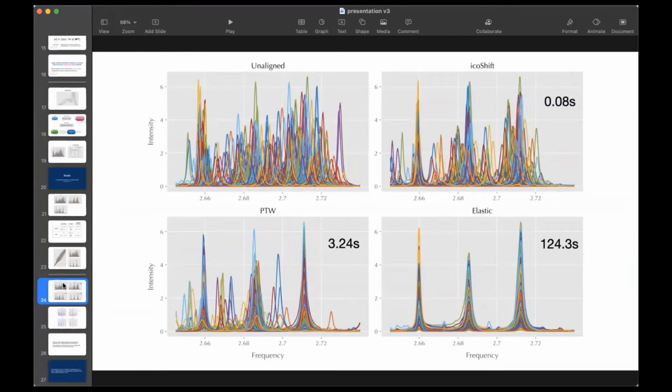As you increase the degrees of freedom on your warping functions, I'm sure you can capture the phase variation, but then you're right that you could overfit, and your phase variation might have fewer degrees of freedom. But to be honest, I'm not sure what the extent of the improvements are.